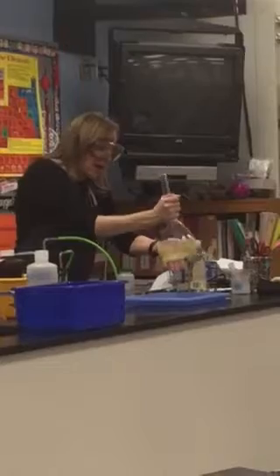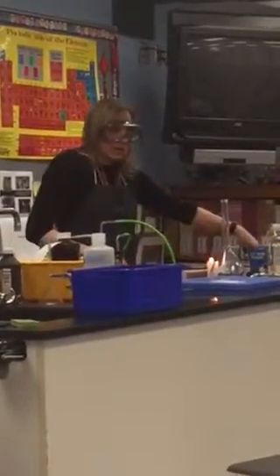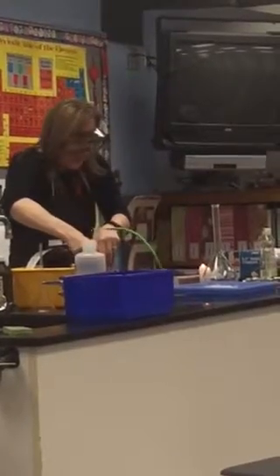So we now have our concentrated hydrogen peroxide here, and we're going to add a catalyst. Are you guys ready? Yes. Okay, before we do that though, sorry, gotta get the anticipation. I want to test for oxygen gas. On your study guide, we said there's a way to test for oxygen gas. Reignite a glowing splint. It'll relight the splint, right? So once this oxygen gas starts forming, we're going to test it. Okay, you guys ready? Here we go.